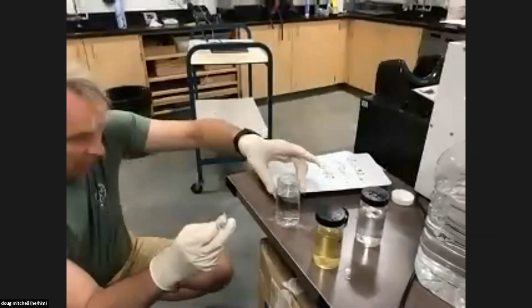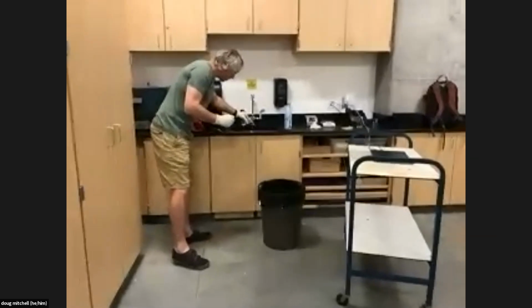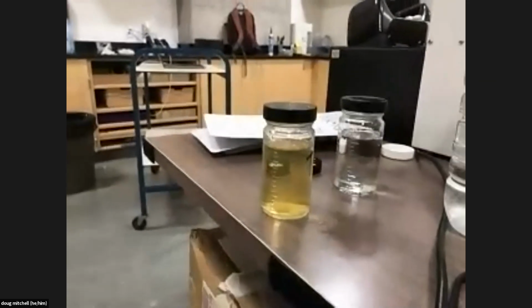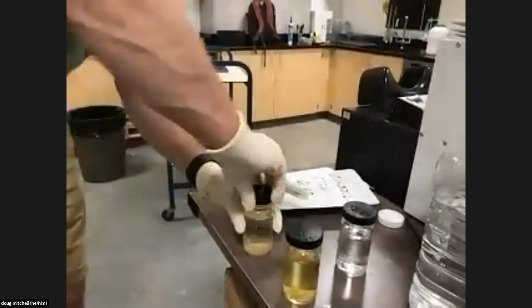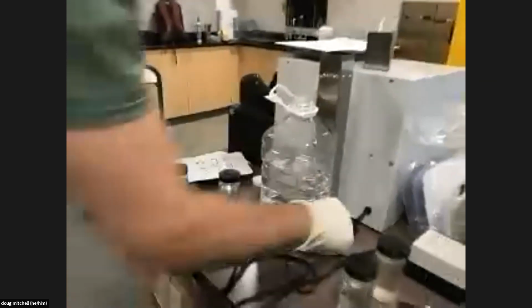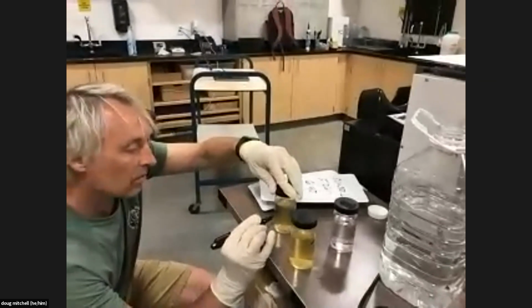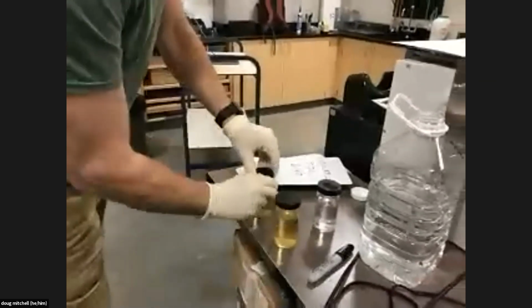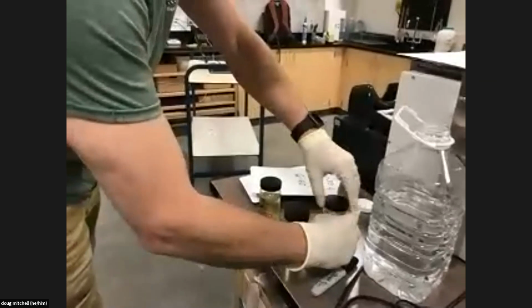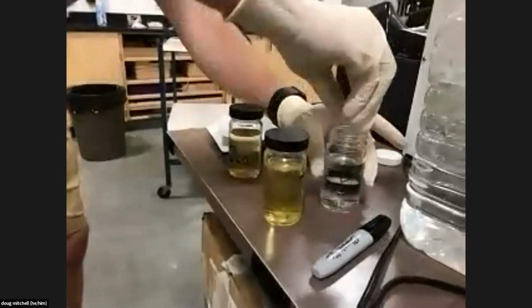Actually, I got a little bit more than 100 milliliters in my control sample, so I'm going to dump a little bit out because it is just straight distilled water. All right, there we go. And I want to label that as well. I didn't label this one like I did with the others. And one for the Gower outfall.